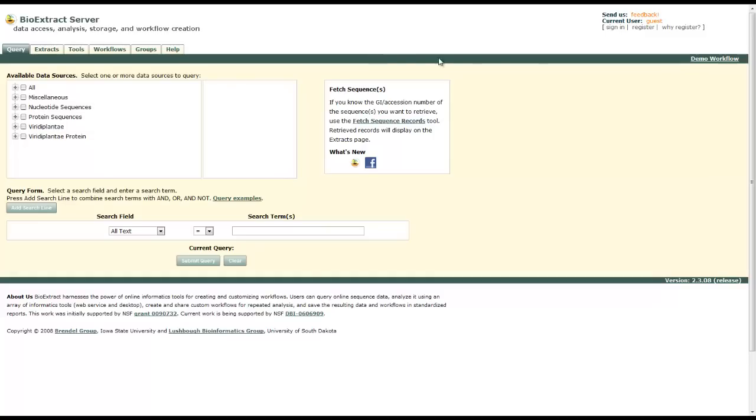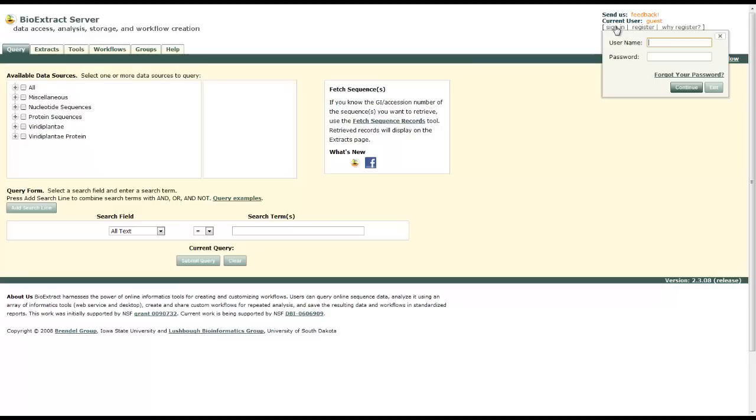If you haven't done so, register by clicking the register section. Take a minute here. That way we can save workflows. I'll show you how to do that. I'm just going to sign in quick.